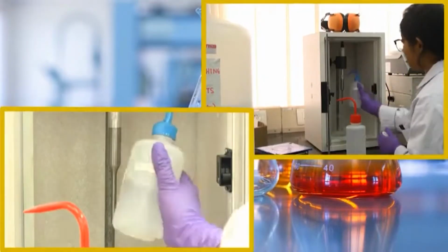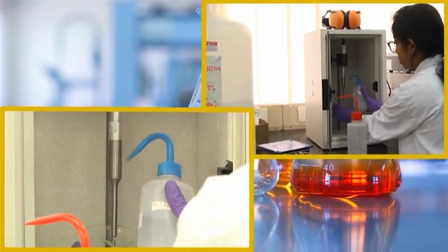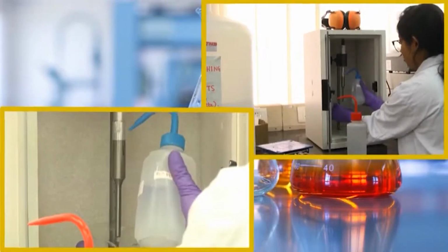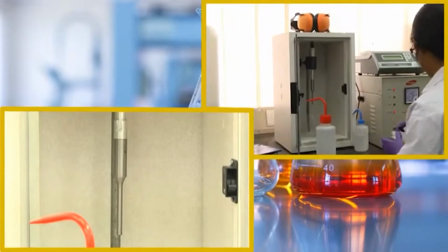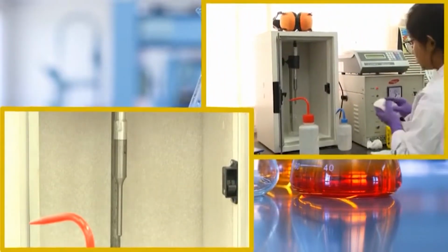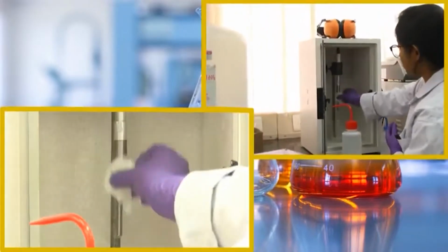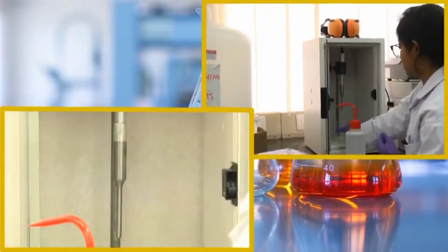So, clean it with water first and then with 70% alcohol. If any proteins or other molecules get stuck to the probe, they will be cleaned off and there will be no bacterial or fungal growth. Before and after using this machine, you should always clean up the probe.